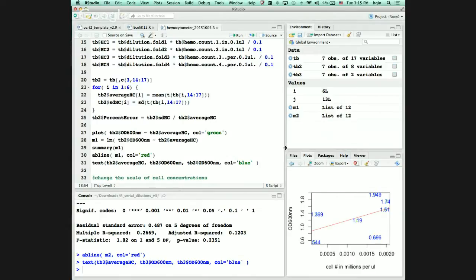Okay, now you have the extracted file. Go to the folder. But make sure you have extracted the zip file. Apparently on Windows, if you do not manually extract it, it does not extract automatically. So you have to do that.